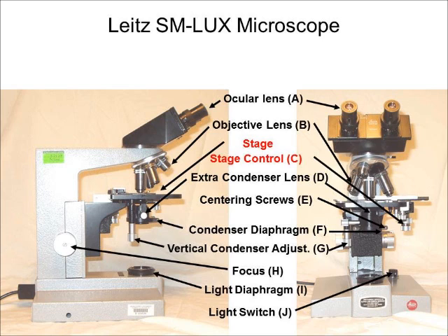Then we have the stage control with which you can move the slide around. As an aside, pathologists who may be looking at scores of slides a day often remove this assembly and simply move the slides around on the stage by hand. However, as beginners I believe that you will find the stage control to be useful.